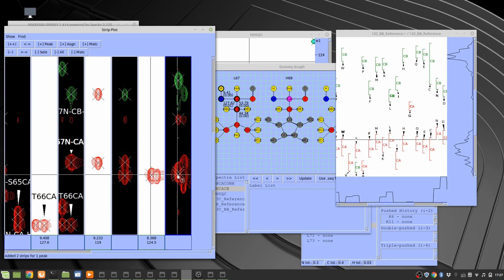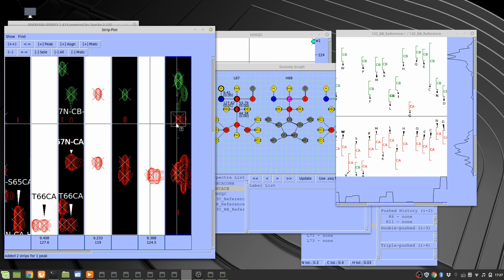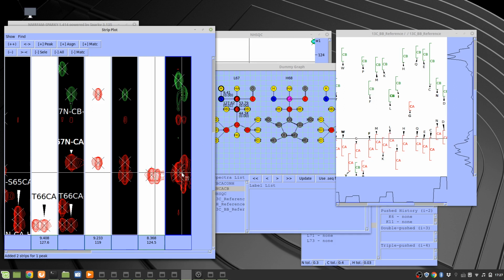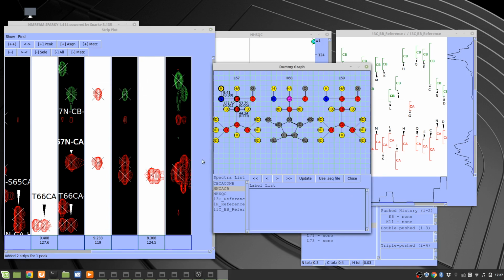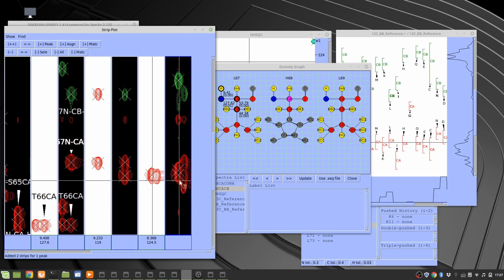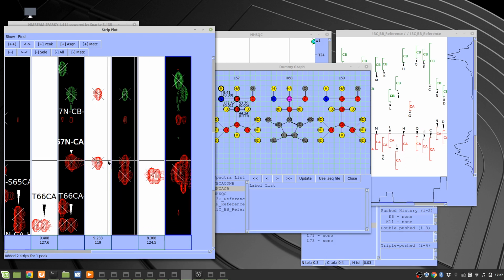I'm gonna place a peak right here and then make the intensity equally distributed to make a shape like this. I think this peak should be around here, and I don't think this one is the correct one, so I'm just gonna delete this. And then if you place your cursor on here, it's leucine, right? Leucine. So we expected leucine 69, and I'm pretty sure that it's leucine 69. This is correct. Histidine 68.